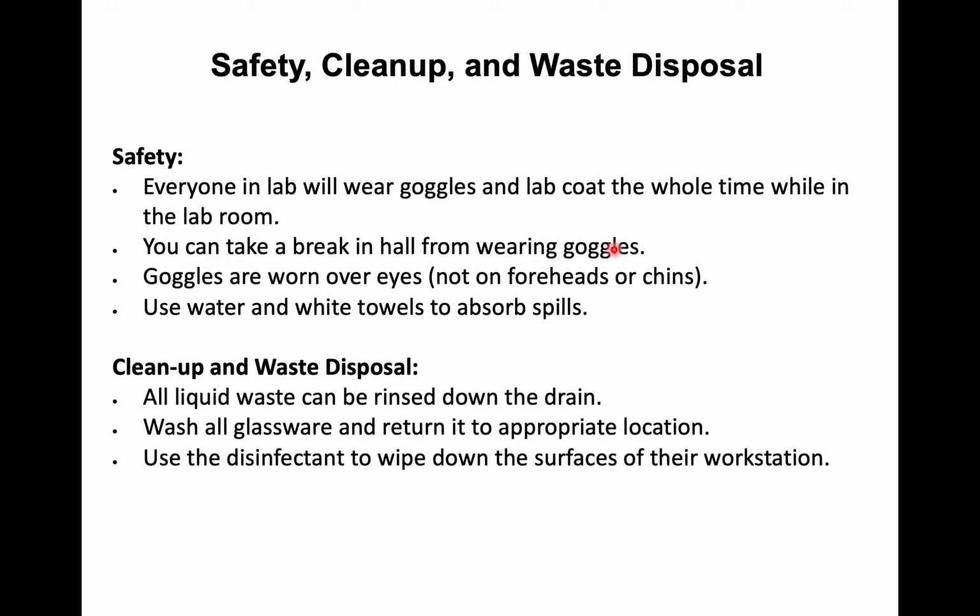Everyone in the lab will wear goggles and lab coat the whole time while in the lab room. You can take a break in the hall from wearing goggles if you need to. You need to keep your goggles over your eyes, not on foreheads or chins. Use water and white towels to absorb any spills. For cleanup and disposal, all liquid waste can be rinsed down the drain. Wash all glassware and return it to the appropriate location. Use disinfectant to wipe down the surfaces near your workstation.